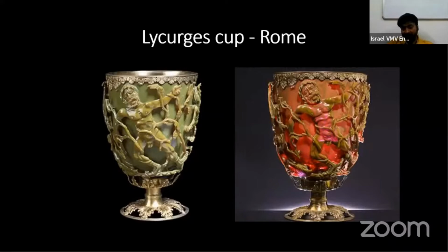Anything can be measured in the nanoscale, but if you are doing something in the laboratory, you should say that it is an engineered nanomaterial for a purpose. And the modern tools of analysis should be employed, justified, and we have to derive properties and tune the properties. That is the focus of modern nanotechnology.